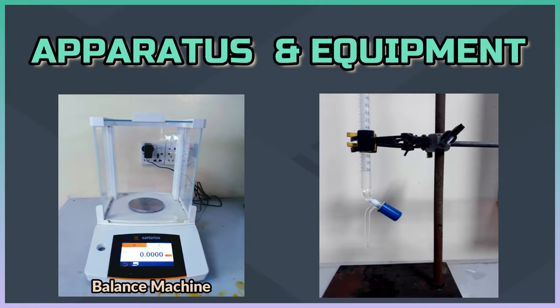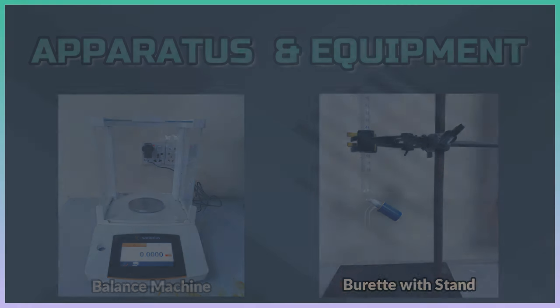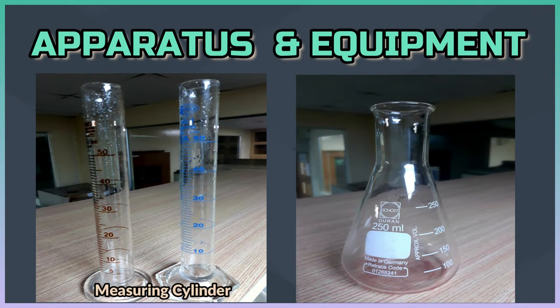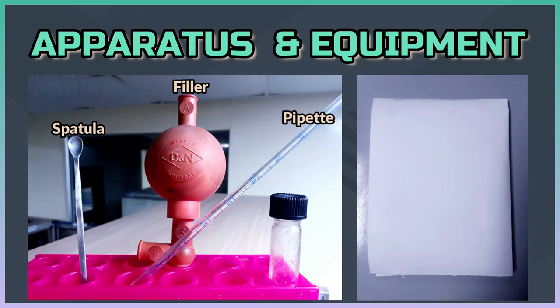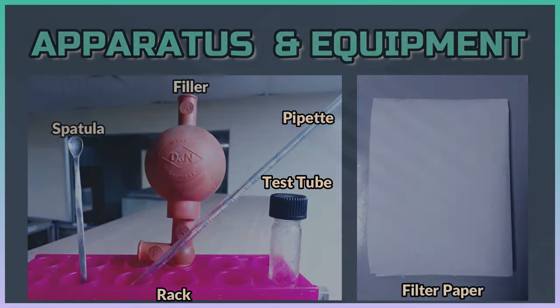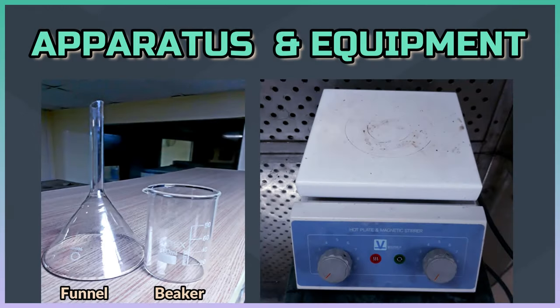To do this test we need a balance machine, burette with stand, measuring cylinder, Erlenmeyer flask, spatula, filler, pipette, test tube, rack, filter paper, funnel, beaker, and hot plate.